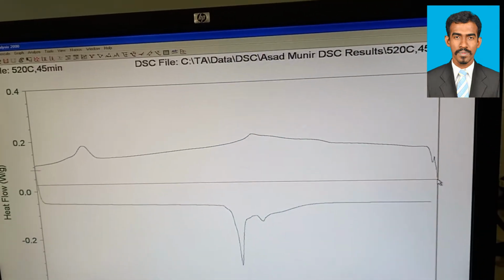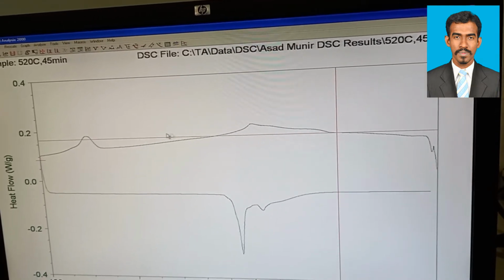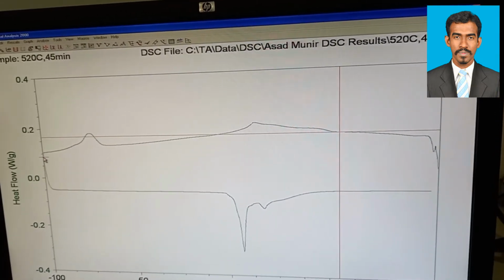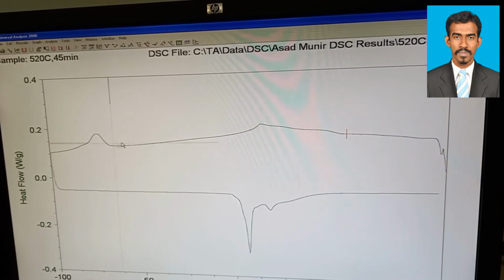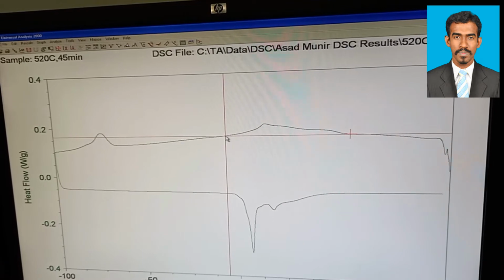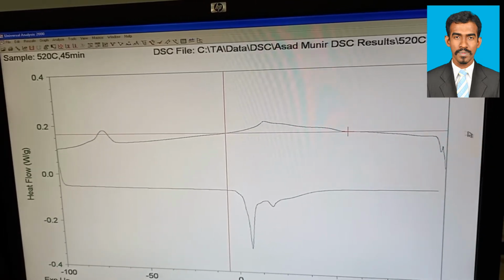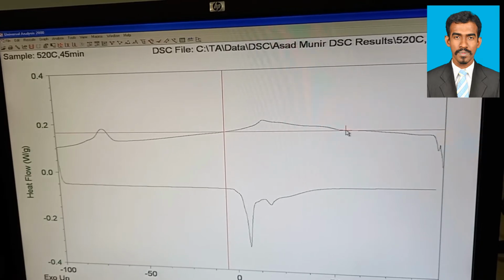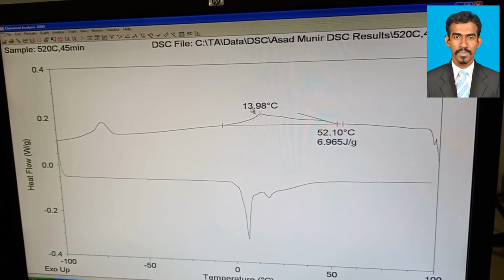We have 2 points. These are the two curves, and these are the peaks where we can highlight our 2 points. The upper one is the cooling curve. So this is our Martensite and this is our Austenite.